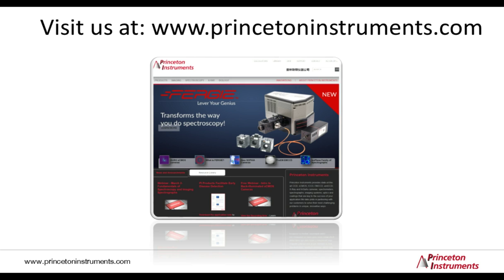Our first question: Is the spectrograph still coma-corrected if the grating is changed to a different groove density grating? Yeah, that's a great question. Unless you have a coma-free system, if your system is coma-corrected, it is corrected for a specific grating angle. So that might be, let's say, a 1200 grooves per millimeter grating at 500 nanometers.